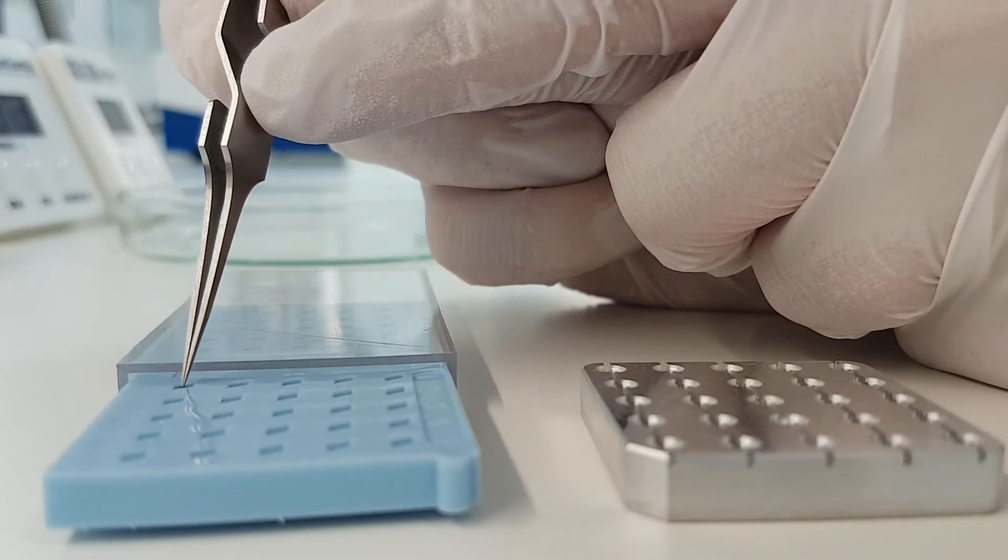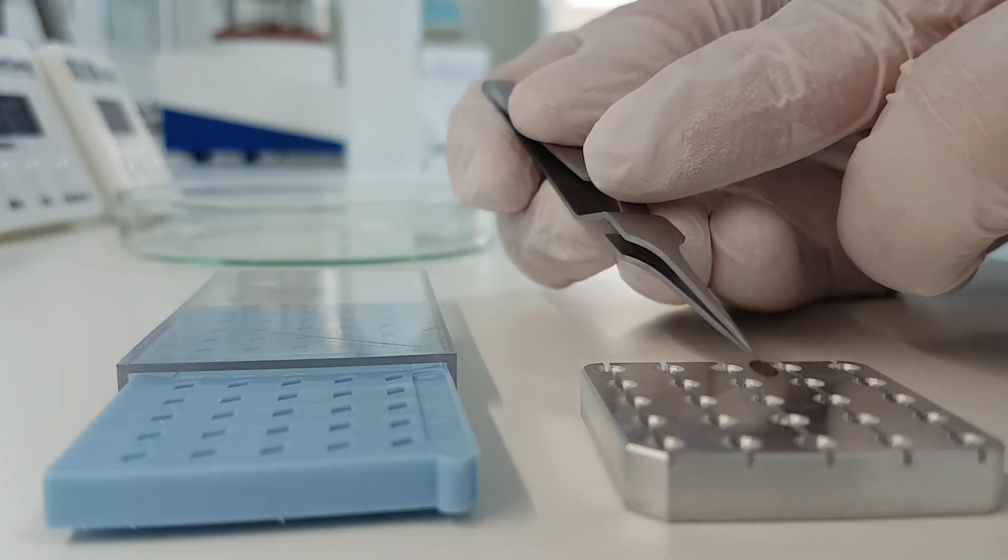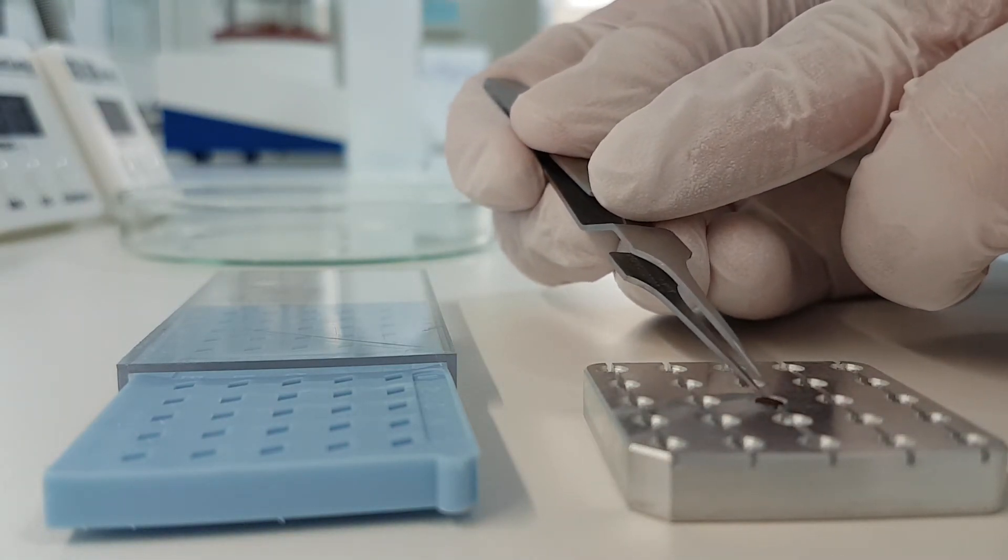Using the supplied tweezers, pick up the grid by the edge, avoiding the mesh area. Place grids onto the metal support.